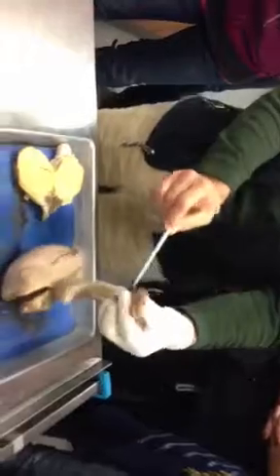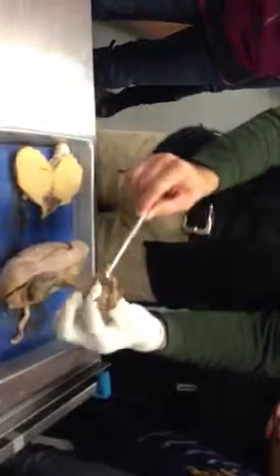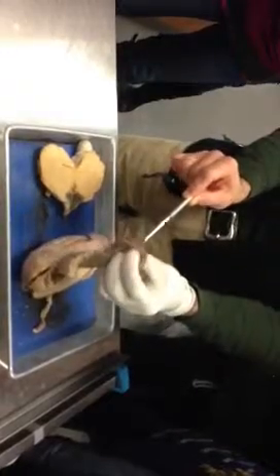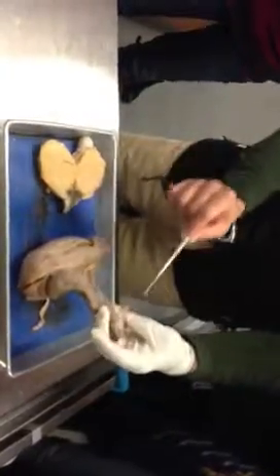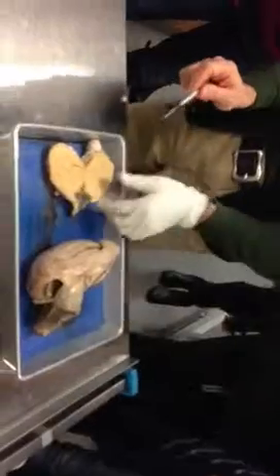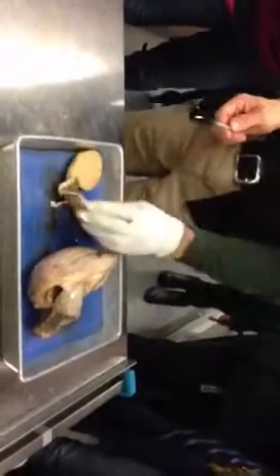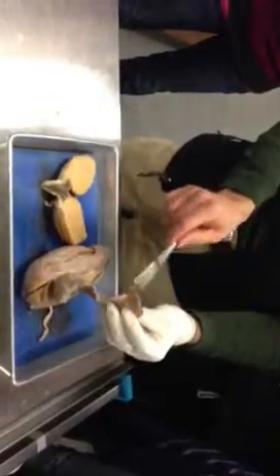That's the cremaster muscle. It's a little piece of it. We don't really get a true representation of it, but that's a little piece of it. And it looks like muscle, and it feels like muscle, and it is muscle. So that's the cremaster muscle. Don't really see a good cremaster muscle in the sheep testicles, so that would definitely be on the bull testis, that cremaster muscle.